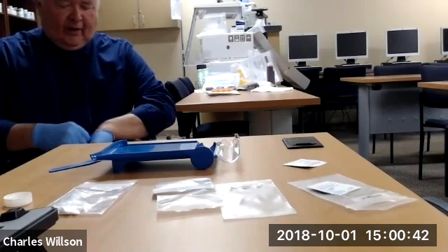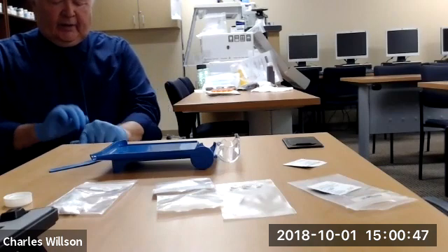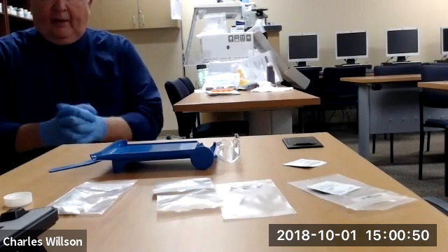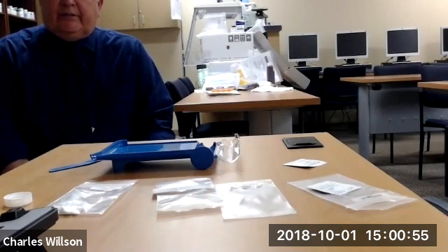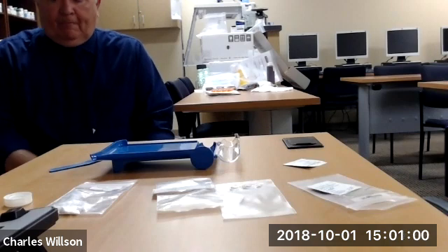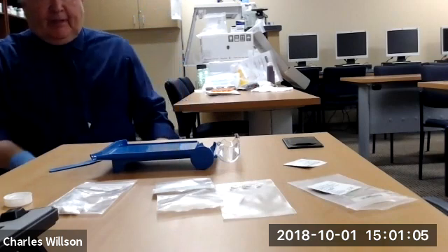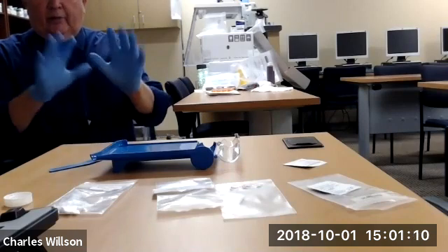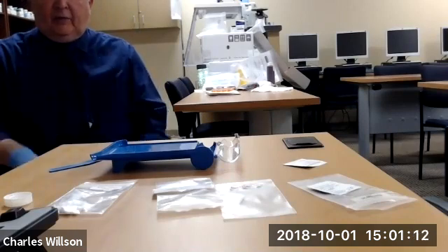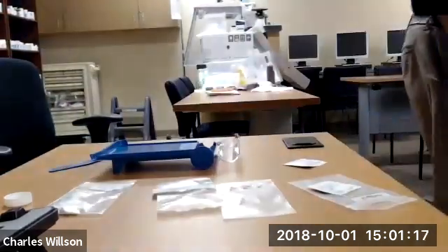Now, if you were doing a lot of repackaging and you were going to be pushing tablets around in the repackaging equipment and so forth, yeah, you would wear gloves. But go into your local pharmacy and see how often you find anybody back there with gloves on. Okay, so this is possibly a little bit unrealistic, but that's okay. We're not trying to simulate reality here. We're just learning to manipulate the things we have to learn to manipulate, okay? Okay. So we've done that.